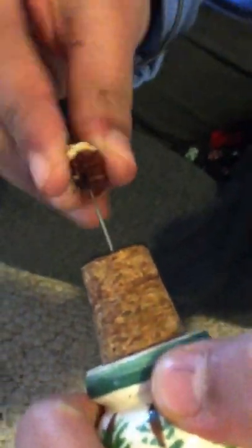So that's simple. And then this is what the nut would be on, and there's a cork with a needle on the top. So we're going to use a pecan to demonstrate, and you just kind of get a little hole, so it's resting on top basically, and you take that and you put it right in the middle of this calorimeter. It's kind of slid to the side because we were tilting it. And then Sarah is going to demonstrate the water.